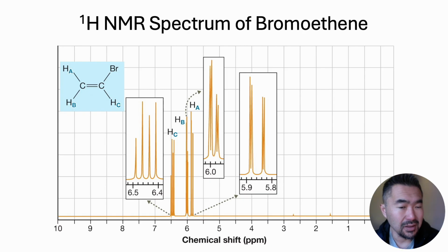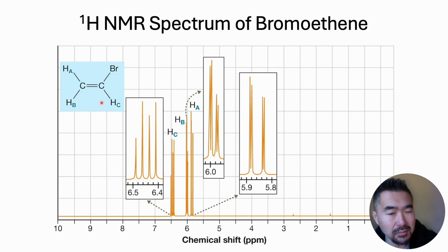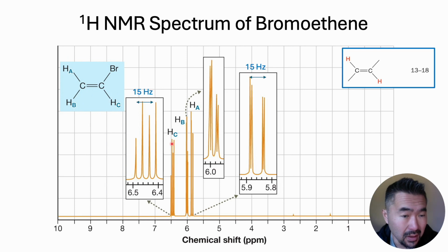And with alkenes, often you could see an interesting situation like this, where if you look at the spectrum of this molecule here, this is what it would look like. Because of the stereochemistry around the double bond, the coupling constant is quite different. Like if you look at the A to C coupling, that is trans, right? Remember, that gives you that very characteristic big coupling constants like 15. And indeed, in this spectrum, we see that splitting. So here's that big 15 hertz split.